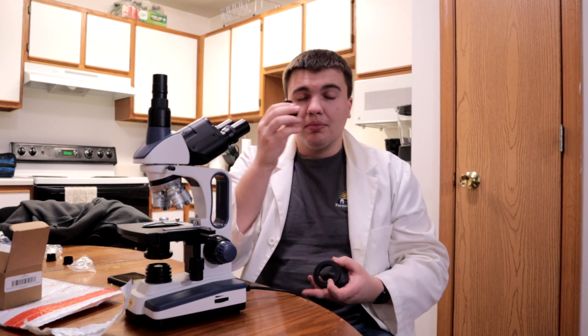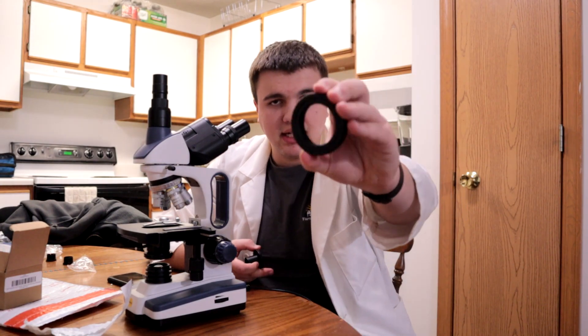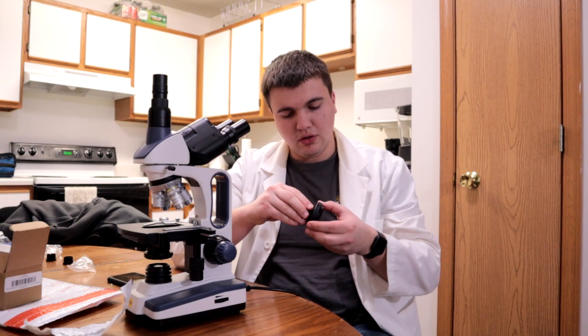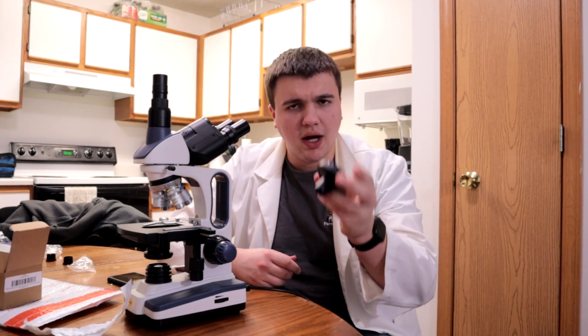It wasn't enjoyable. Plus, this piece — this little piece here — doesn't just screw into the camera. It needs a T-ring adapter, which, simple enough, screws in just like that. And we're able to move on with our lives.